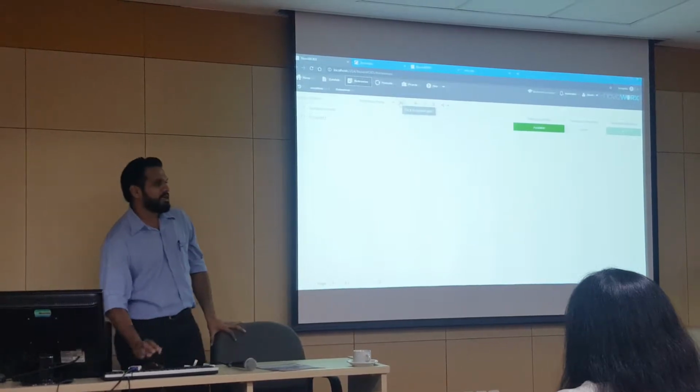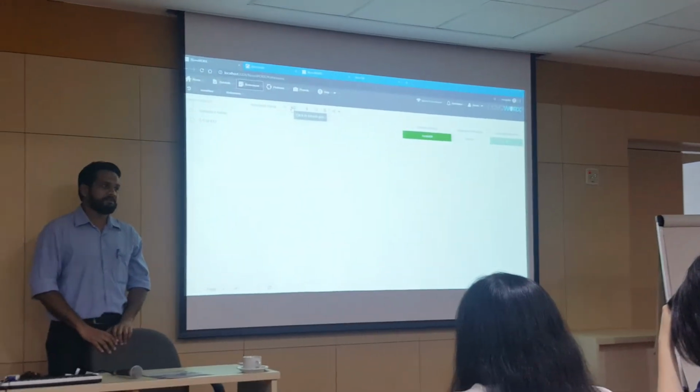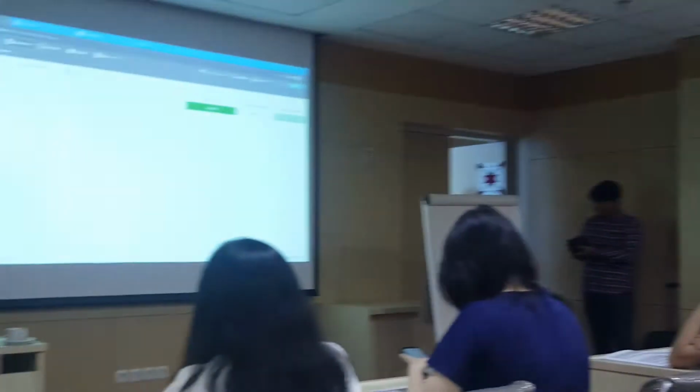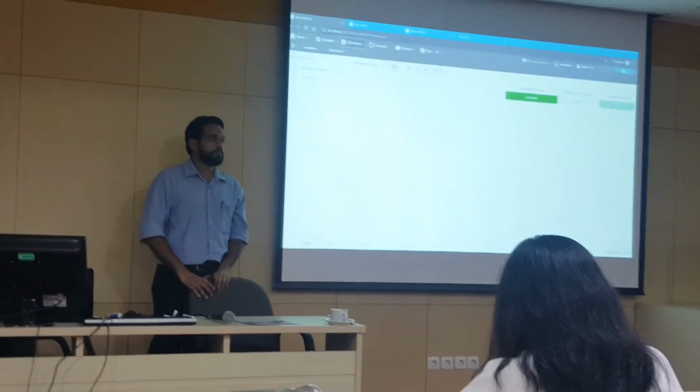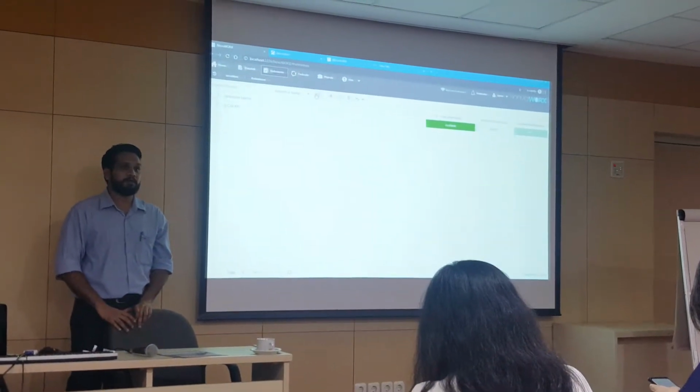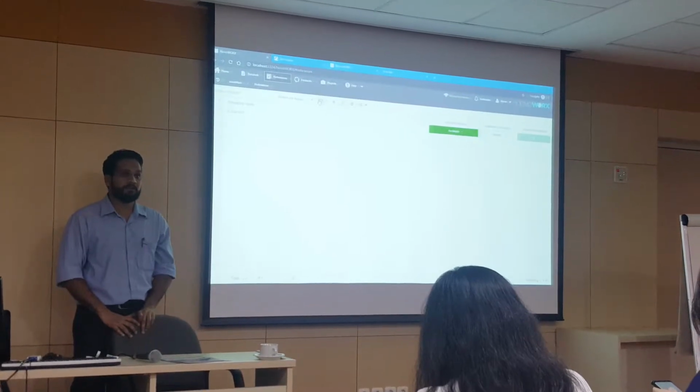So in novoWorx, we have two types of references: the standard references that we build for you, or also the references that you can build yourself. If you have any standard FASTA file, you're able to upload it to novoWorx and actually build your own reference. So you don't have to use a publicly available reference. You can also use your own reference if you have a reference file.